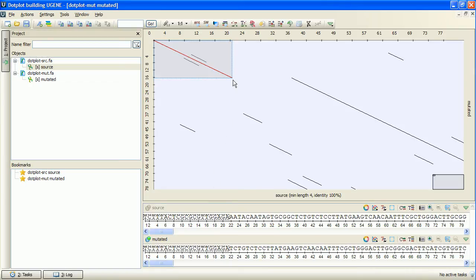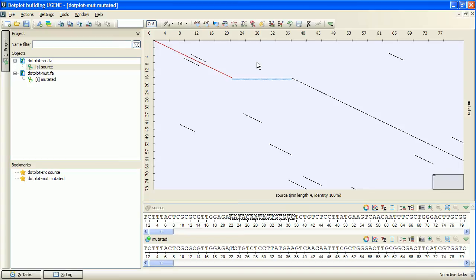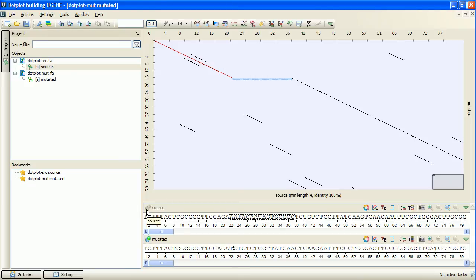The nearby gap is a deletion from the source sequence, since the whole gap is located at the x-axis sequence, which is, in our case, the source sequence. A deletion is a kind of dotplot frameshift. The deletion itself can be read from the details view.